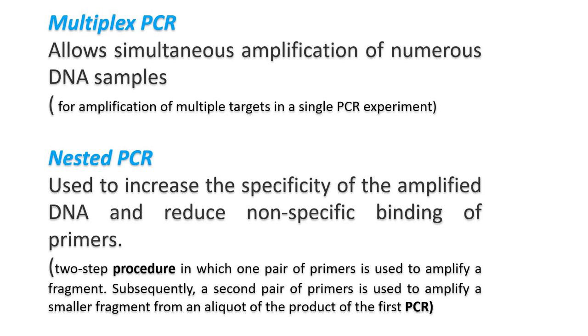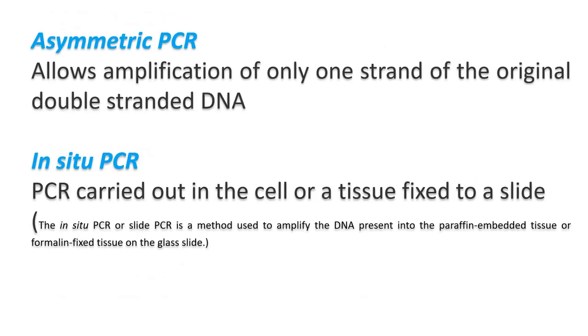يعني الخطوة الأولى أن fragments of DNA صار بيها amplification for large specific fragments، وبعدين هذا الفراجمنت دخلناه بستيب ثاني حتى نسوي له يعني amplification more and more، وبالتالي احنا راح نكون كل شيء specific وsensitive لذلك السيكونس أو الفراجمنتس of DNA. Okay. الأذر last two types مذكورة عندنا هنا بال PCR called the asymmetrical or asymmetric PCR with amplification of only one strand of the original double stranded DNA.